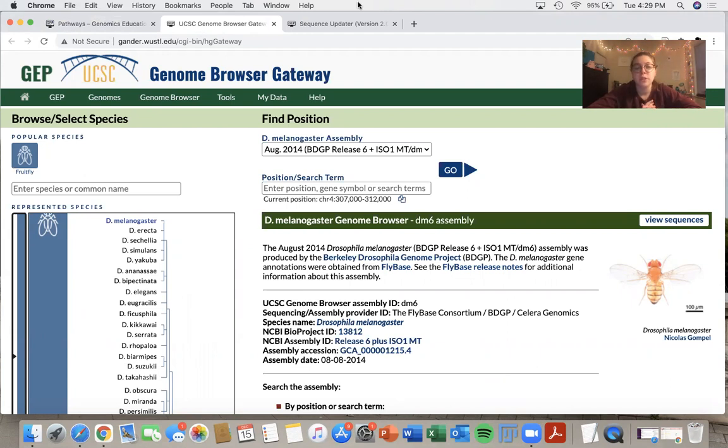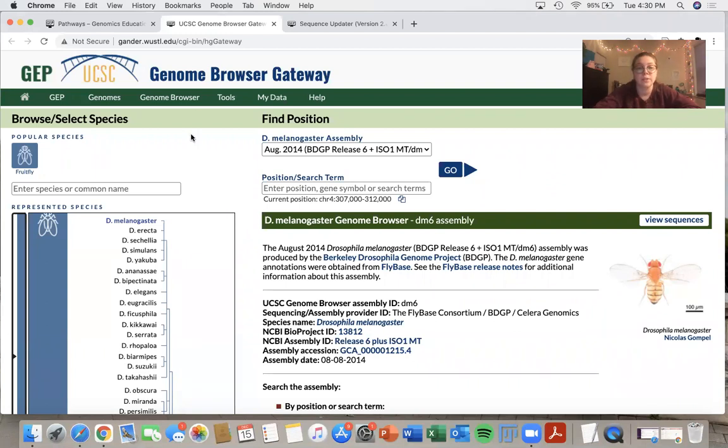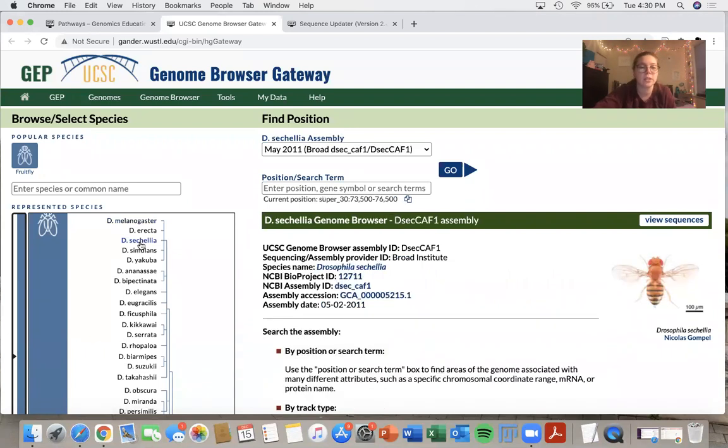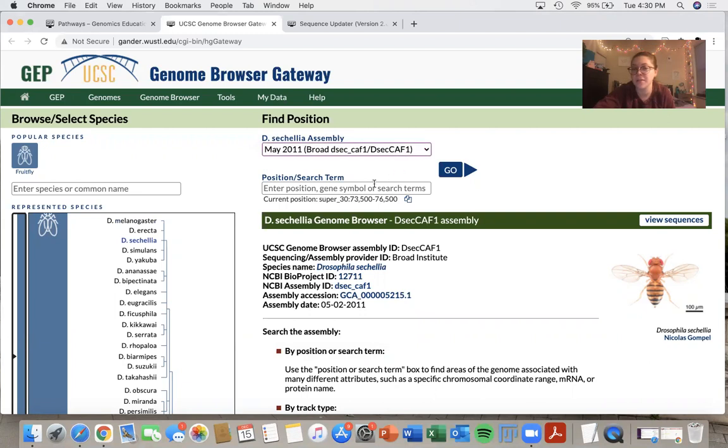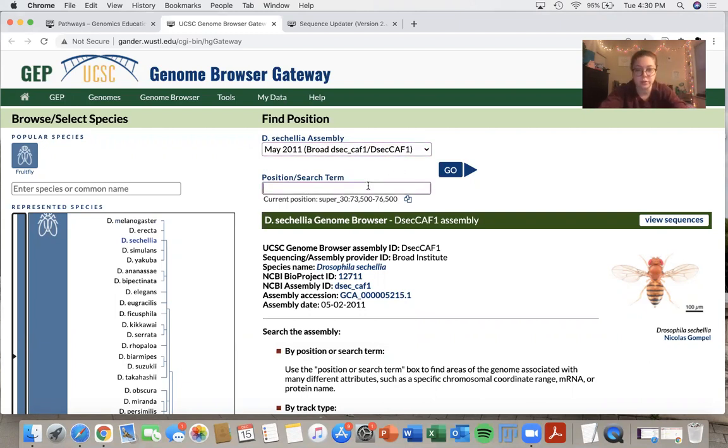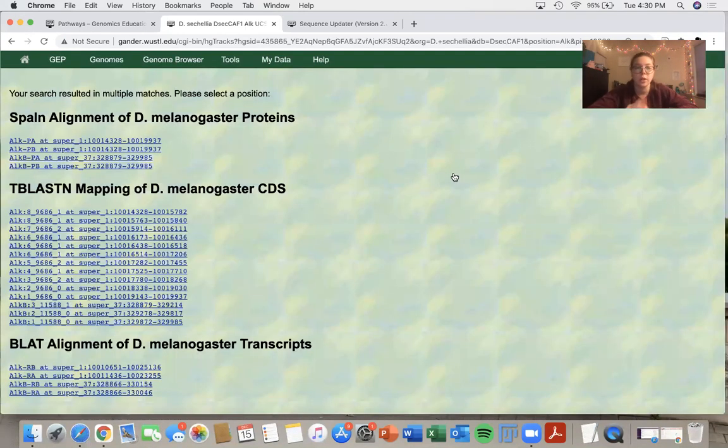I'm going to show you today how to use the sequence updater using a consensus error that I made up in the species Drosophila sechellia. So in my genome browser, I will click D. sechellia, select the assembly that I want, which is the only assembly that I have, and I will type in ALK because that's what I want to look at.